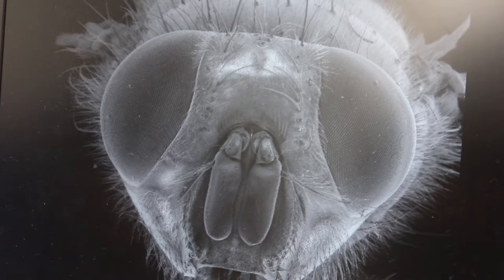Other areas we're interested in include entomology, looking at different types of insects. That's particularly useful for better understanding the structures of the insects themselves, so we can see the fine detail and exactly how they look on the surface.